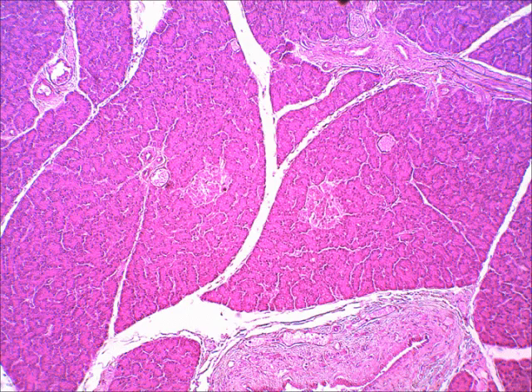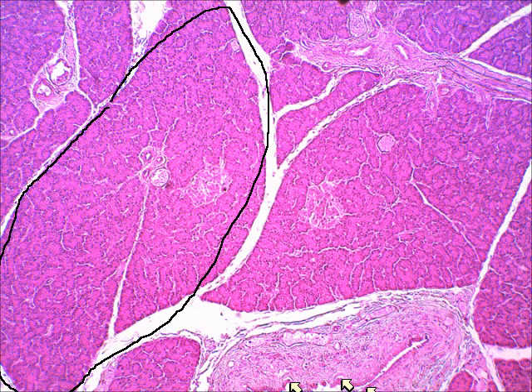If we look at this slide more closely on a higher view, again down at the bottom here, this is the pancreatic duct. But if we look at one of the lobes, let me circle the lobe I want you to look at. Let's look at this one. In this lobe, right here where I've got the arrows, that is an islet of Langerhans. If I encircled that islet, it would be right there. So that's the endocrine area.